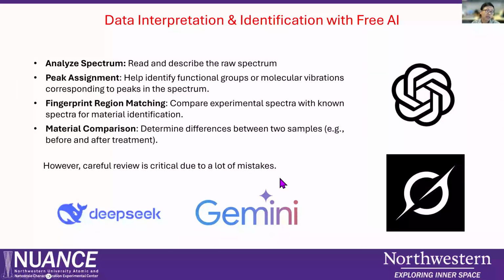For Raman and IR peaks, when people analyze, they want to click and get the information about what it is, probably because they are trained on XPS. The XPS software is smart. You click, it gets the peak ID, gives you a peak table, and tells you what elements are on the surface. But for Raman and IR, you don't have that function or database. You have to manually find the peak position, find the handbook, and find what peak it is.